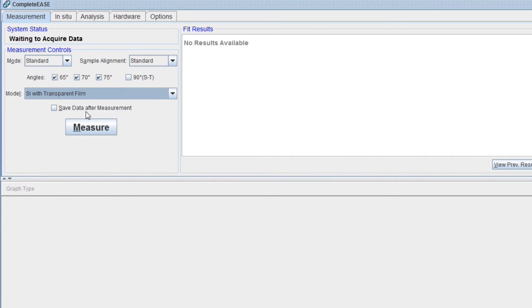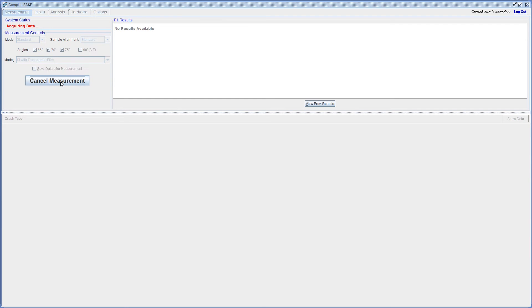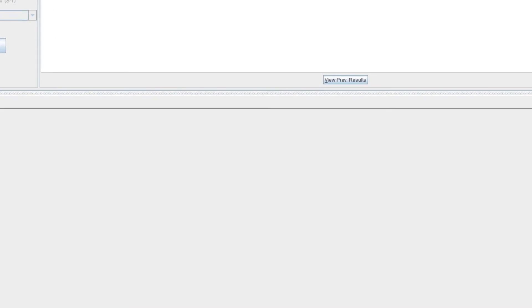When your selections are complete, simply press measure. The software will prompt you to change the angle of incidence if needed.